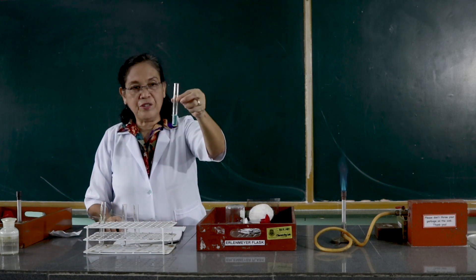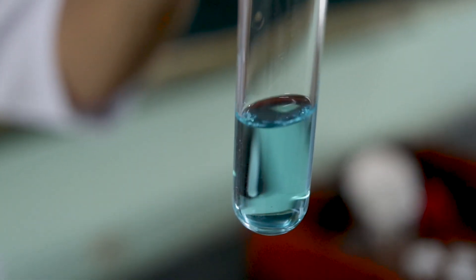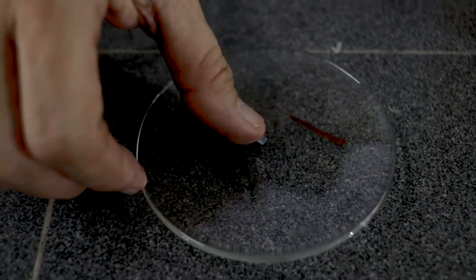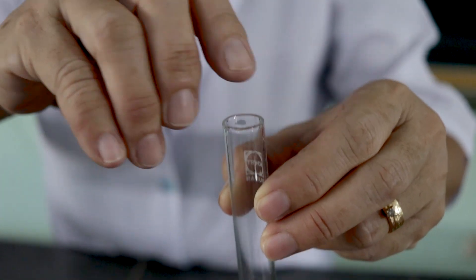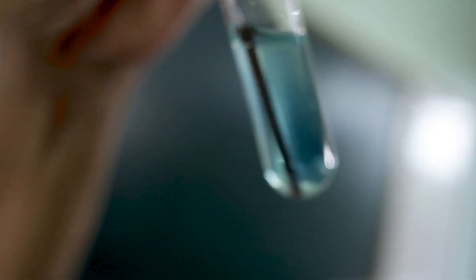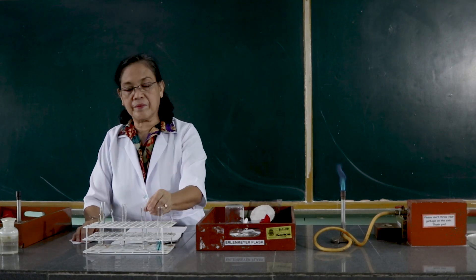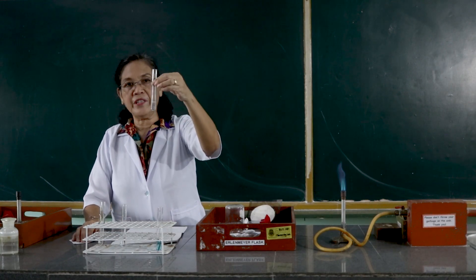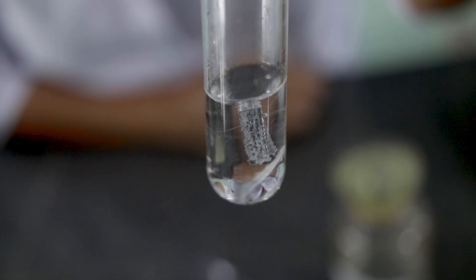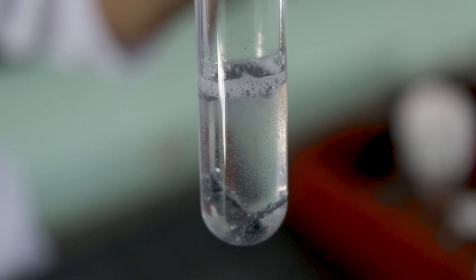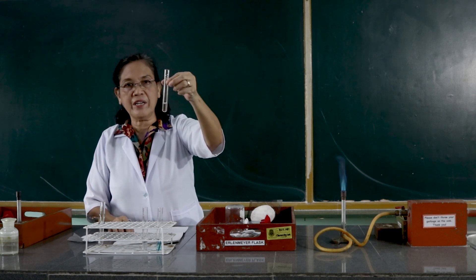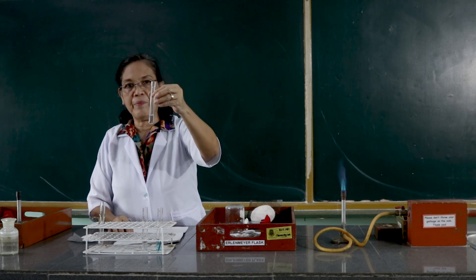To the first test tube containing the copper sulfate, we are going to put here an iron nail. To the second test tube containing the zinc sulfate, we are going to add the magnesium ribbon. To the third test tube containing the silver nitrate, we are going to add a copper wire.